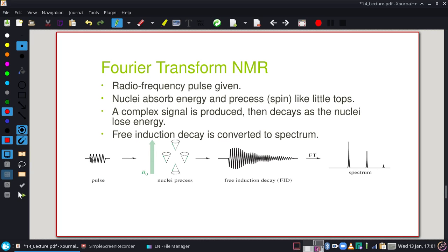So when we put our sample inside our magnetic field, we get it resonating and get that NMR resonance going by pulsing it with a large RF signal. That pulse gets our nuclei spinning in and outside of that resonance, and they're going back and forth. But it does create a bit of chaos. It actually gets them all going, and we get this kind of a weird decay, and it does come out looking like this. It's going to steadily get smaller because we're going back to a normal state where they're mostly not flipping back and forth. But we're going to get these weird patterns.